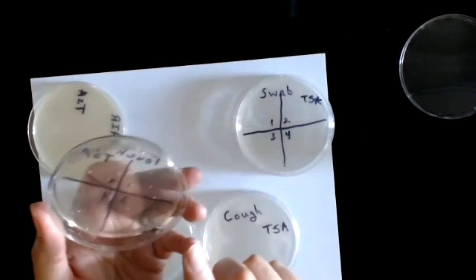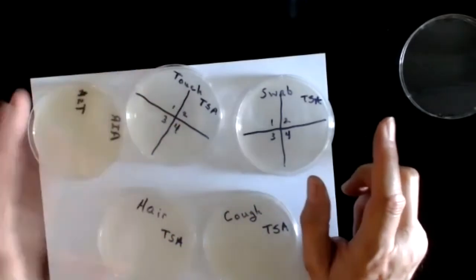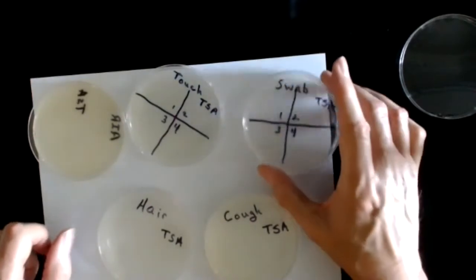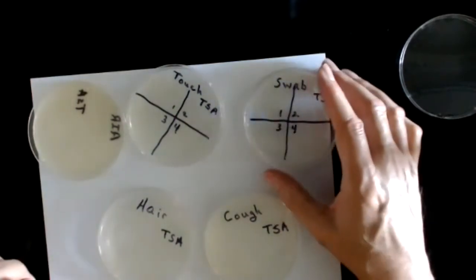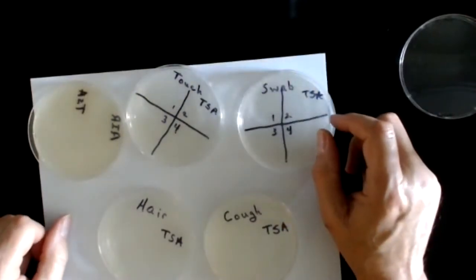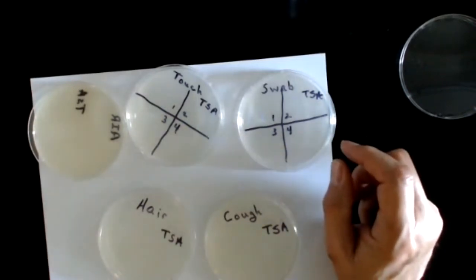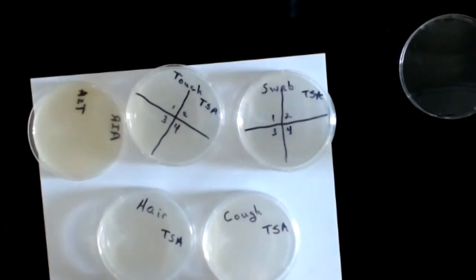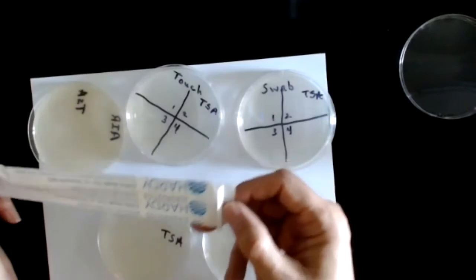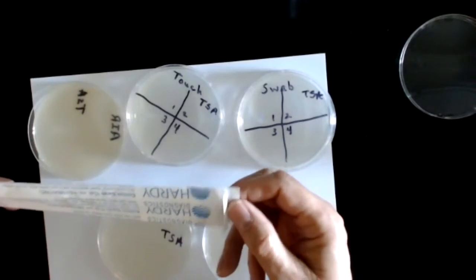Once all 4 students have each touched a different quadrant, the plate is then put back down, upside down, the way we started. The third plate is a swab plate. In order to use the swab plate, we need to have available to us several sterile swabs. When we do lab exercises like the one we're doing today that require swabs, we provide the sterile swabs for you.